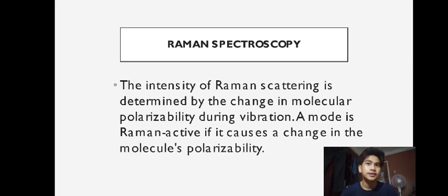The intensity of Raman scattering is determined by the change in molecular polarizability during vibration. A mode is Raman active if it causes a change in the molecule's polarizability.